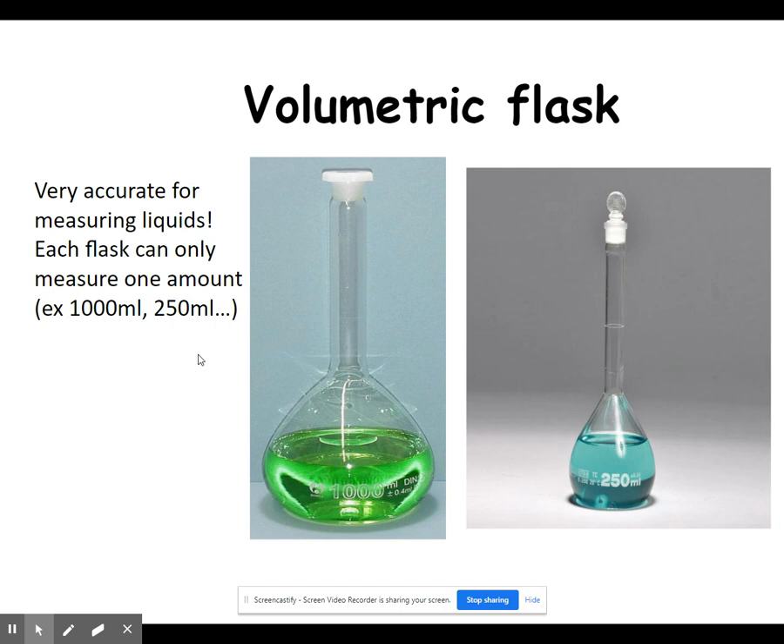The next piece of glassware is a volumetric flask. Volumetric flasks are used to measure at a very specific volume — they are very accurate, but each volumetric flask can only measure one volume. The one on the right only measures 250 milliliters, and the etched line in the neck of the flask corresponds to that measurement. The green one on the left measures 1000 milliliters, and somewhere on its neck there is a line corresponding to 1000 milliliters. There is no way to measure any volume other than the one marked. These come in a wide variety of sizes — typically 1000, 500, 250, and 100 milliliters.